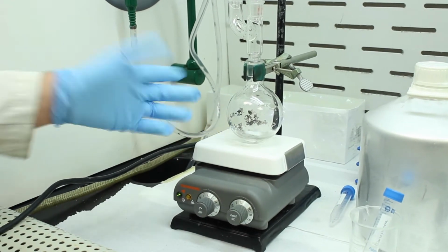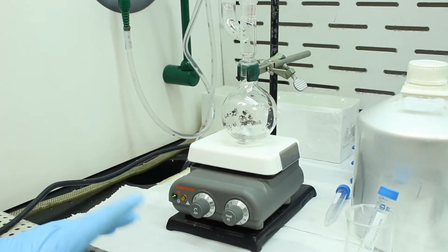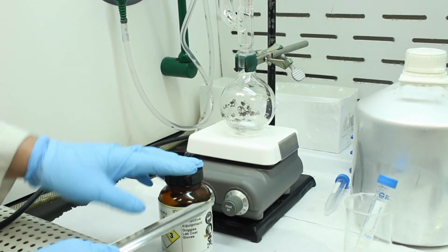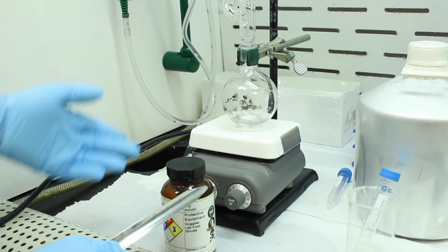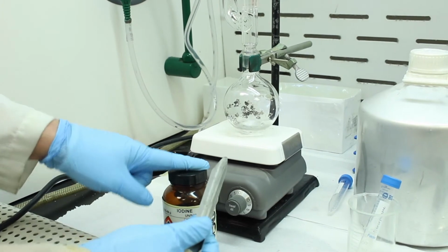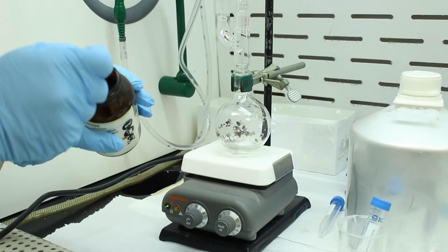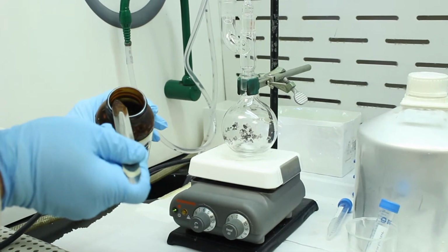It's not initiating. So we're going to employ one of the tricks. There are numerous tricks people do to initiate Grignard formation, and the one we're going to use is we're going to add a crystal of iodine. The iodine will help sort of etch the surface of the magnesium metal, increasing the surface area so it begins to react. So I'll take a crystal of iodine and then basically place it in here. And it's going to color the solution a little bit, but that's okay. So we'll take just one crystal of iodine. So that should be enough here.